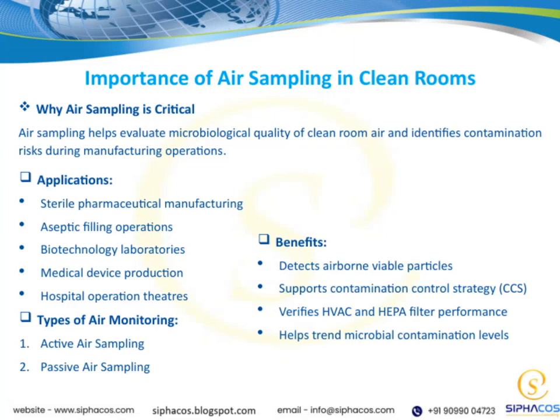Let's take a closer look at why air sampling is so important in clean rooms. It's a critical part of maintaining the integrity of environments like sterile pharmaceutical manufacturing, aseptic filling operations, biotechnology labs, medical device production, and even hospital operating theaters. These are all areas where even tiny amounts of contamination can cause significant issues, so monitoring the air quality is essential.